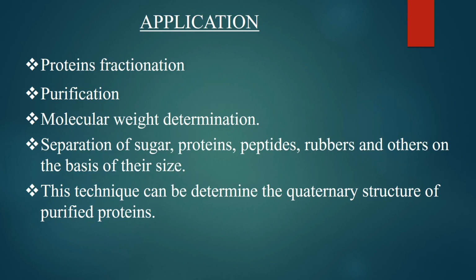The application: protein fractionation, purification, molecular weight determination, separation of sugars, proteins, peptides, rubbers, and others on the basis of their size. This technique can be used to determine the quaternary structure of purified proteins.